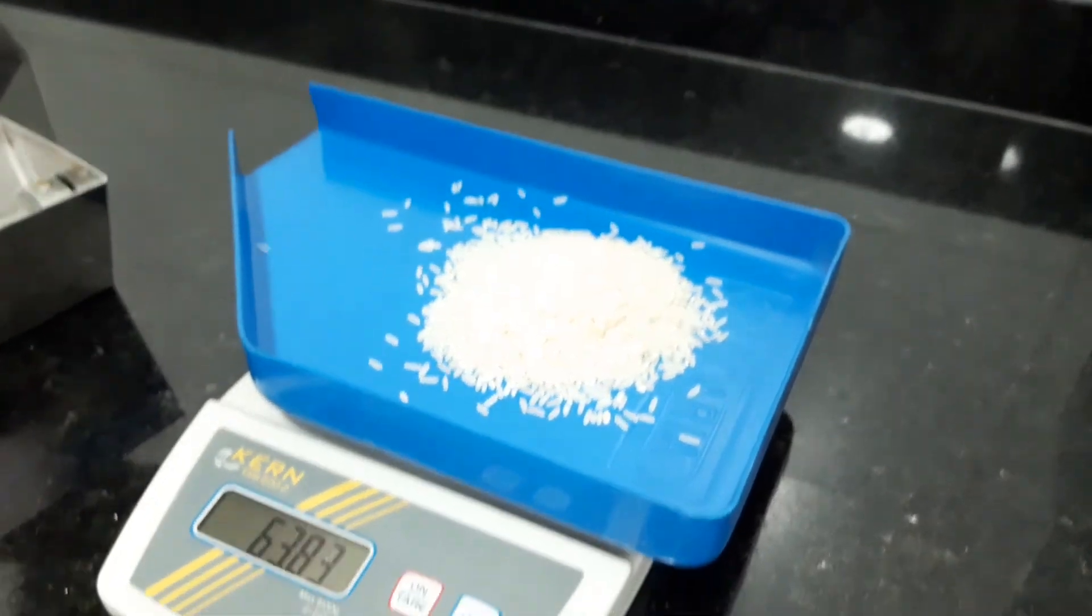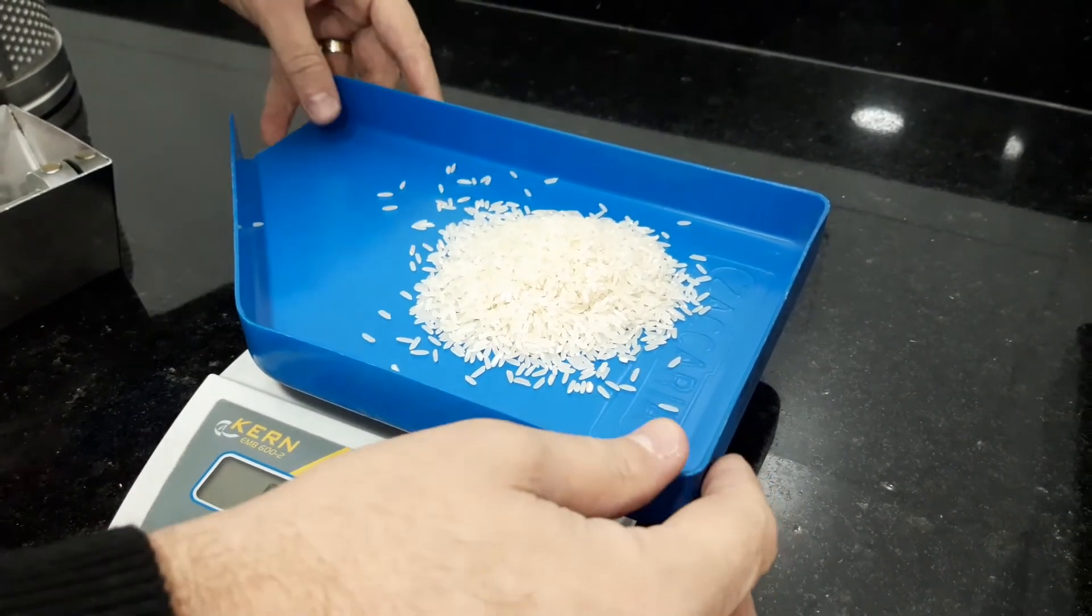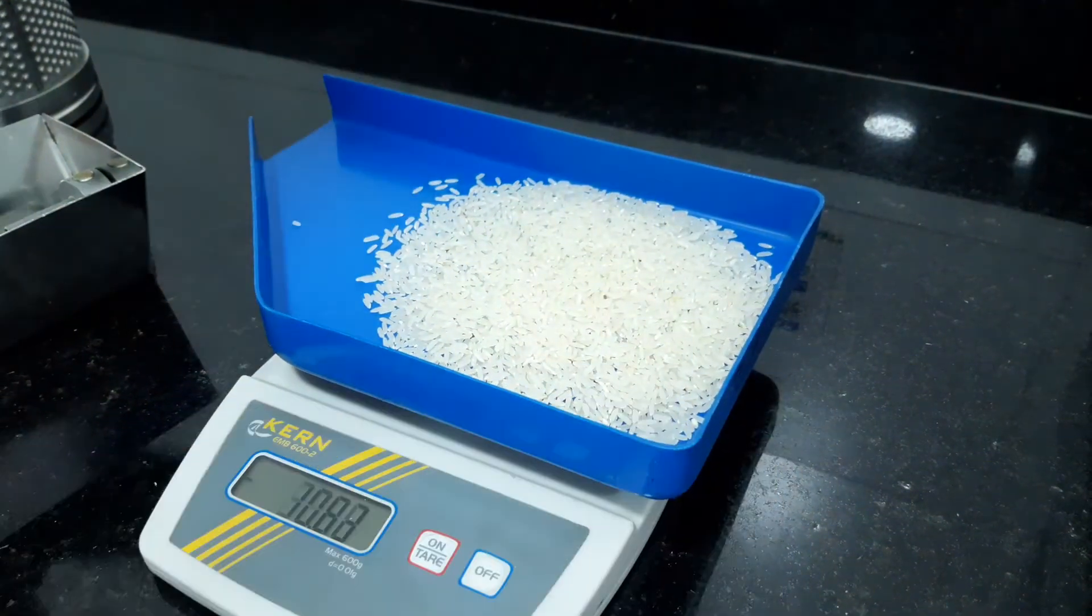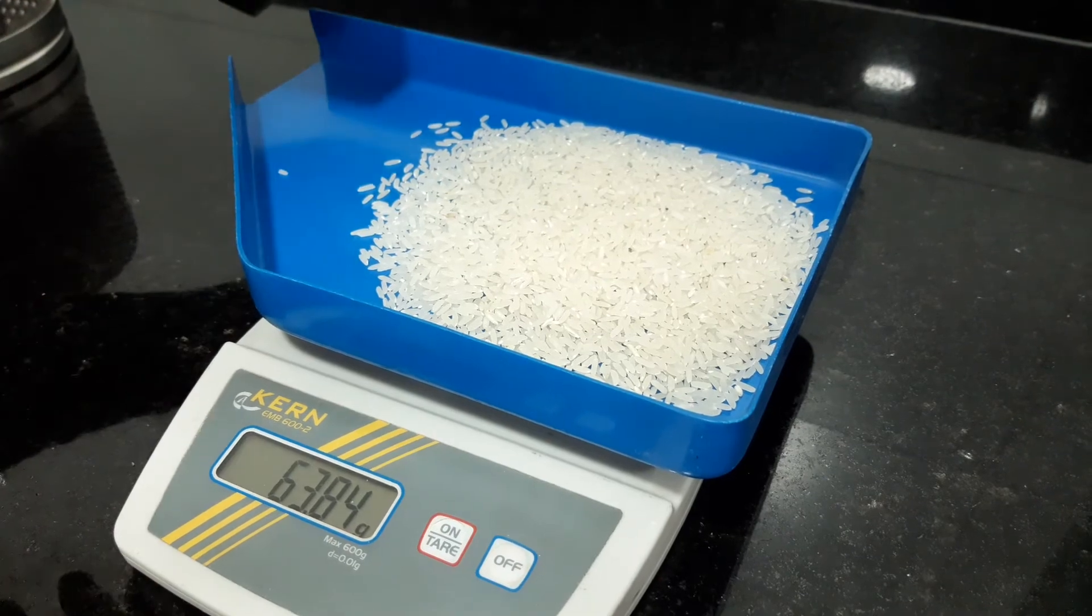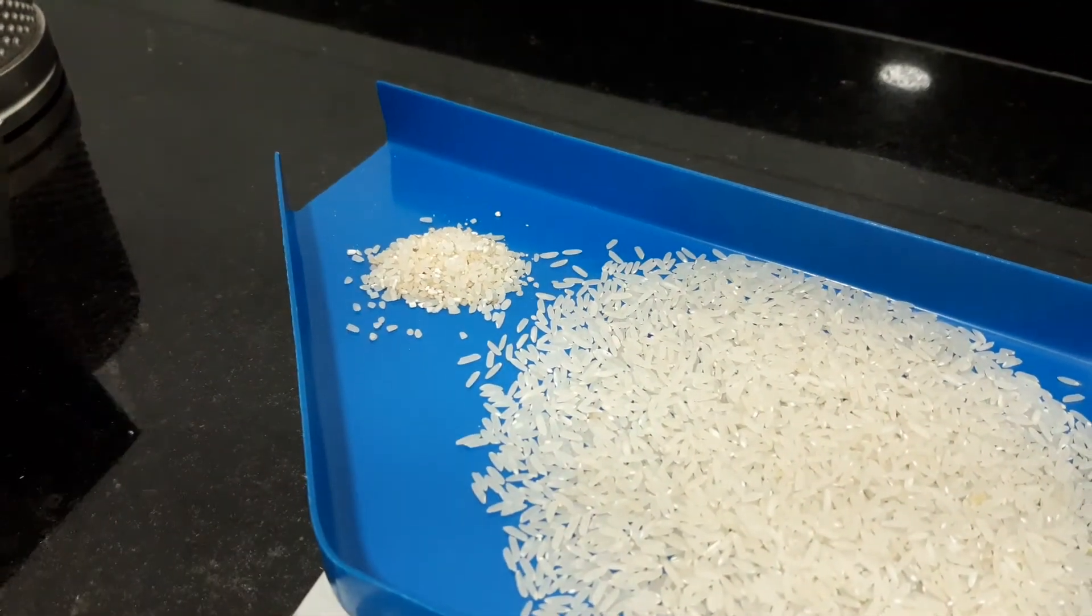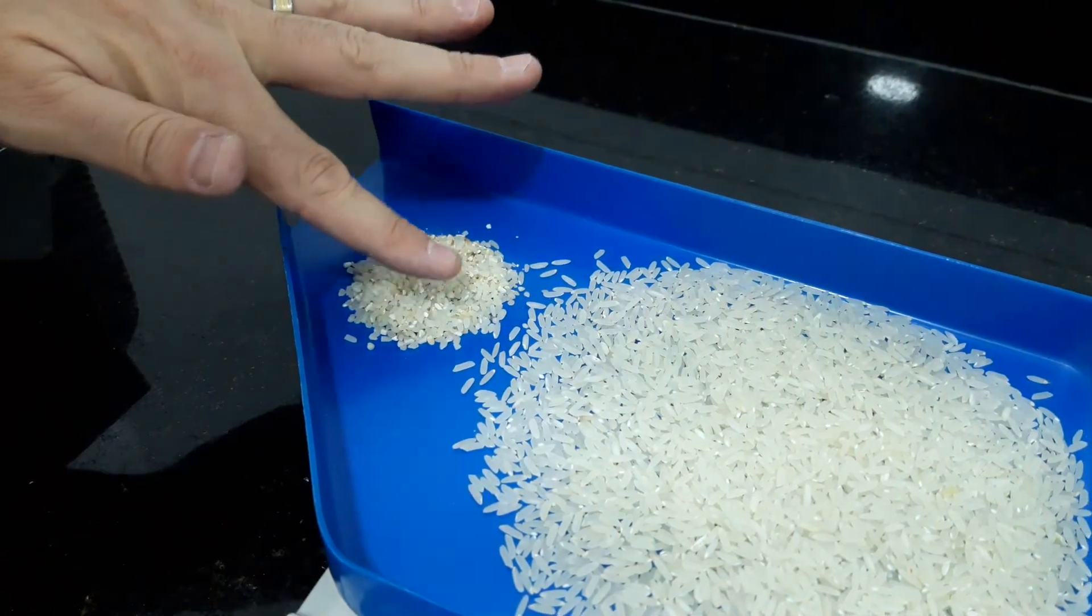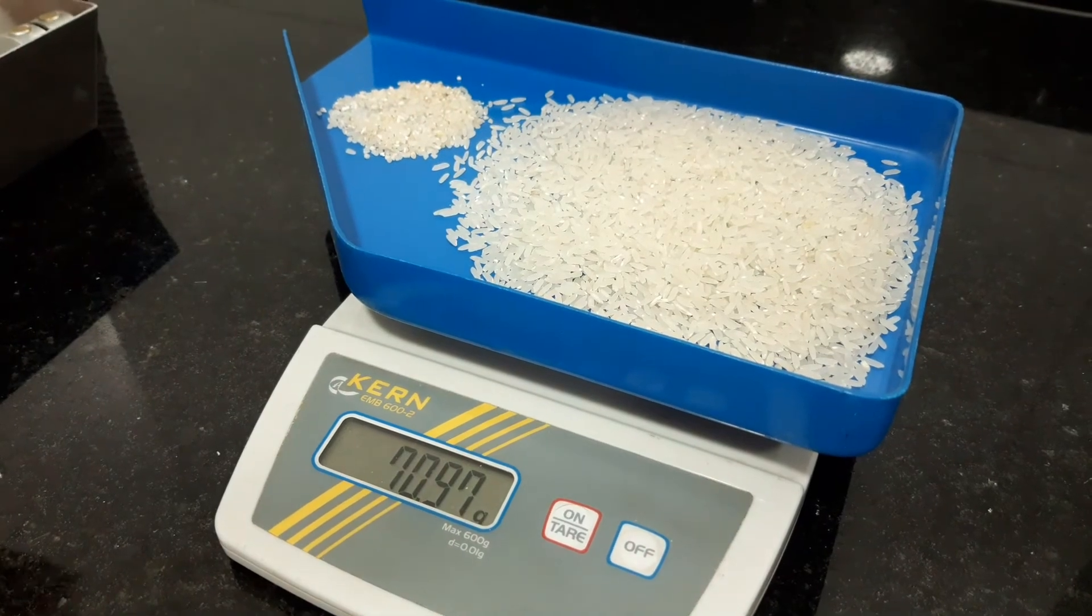We can discharge from here. We have, from 70 grams, we have 63.84 whole grain, and the rest will be the broken. So here we can see exactly the broken and the whole grain.